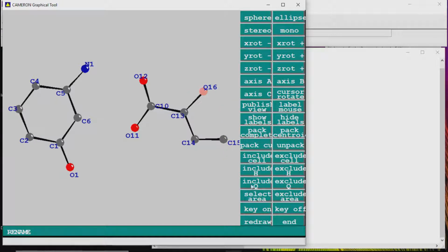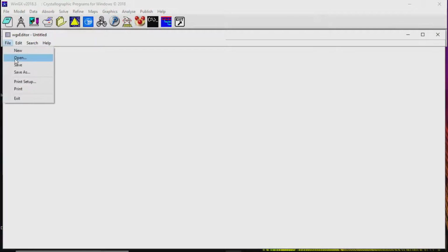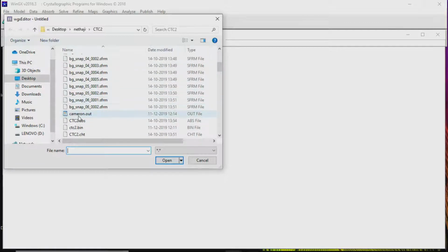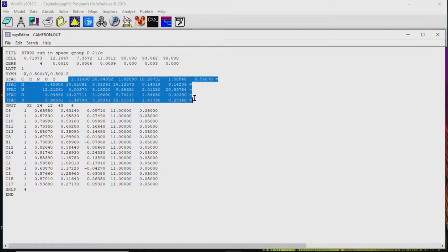Rename. So 15, 16, C17, N, close it. Now I renamed it. Now it is better to arrange them in the order. Okay. So again H, N, O, S. Here we got a sulfur in the molecule as per the expected molecule formula.